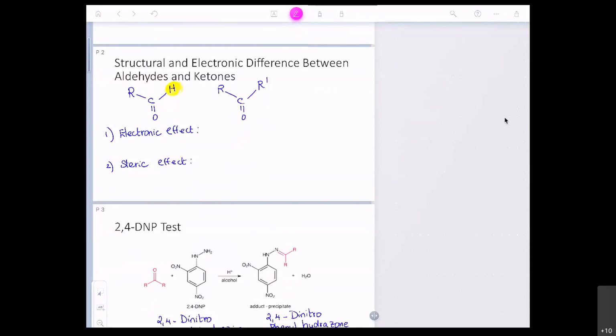So chemical tests are typically ones that show you the four indicators of a reaction. The first one being a permanent color change, then maybe a temperature change that you can identify using a thermometer, a gas evolution, which you can see with bubbling or effervescence, and then a precipitate formation accompanied by a color change. These are things that are very easily perceived by our senses, and that's pretty much the foundation of chemical tests.